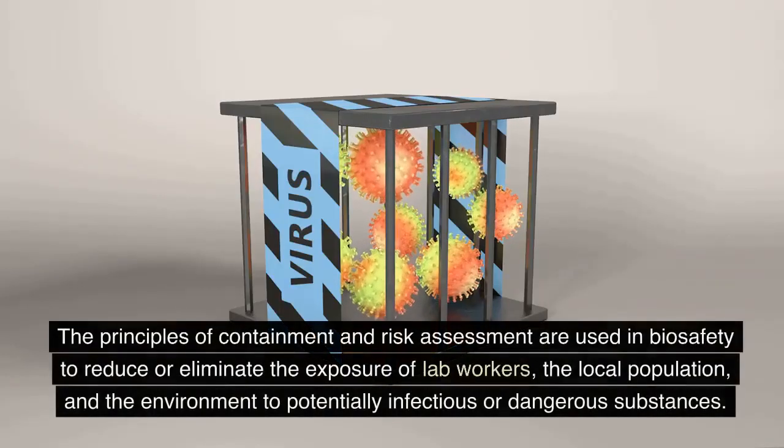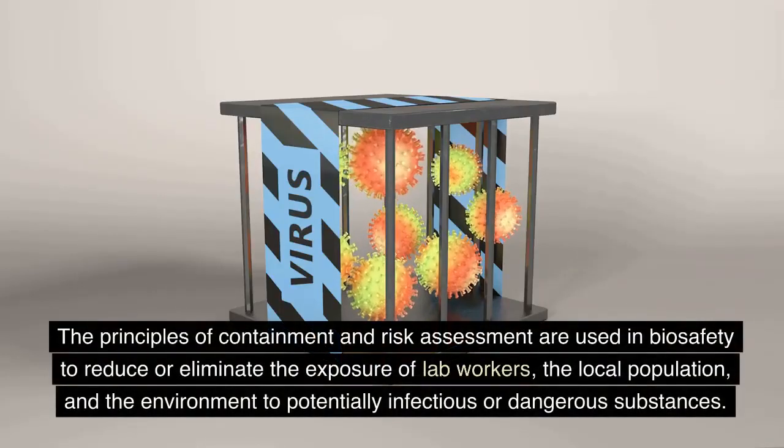The principles of containment and risk assessment are used in biosafety to reduce or eliminate the exposure of lab workers, the local population, and the environment to potentially infectious or dangerous substances.